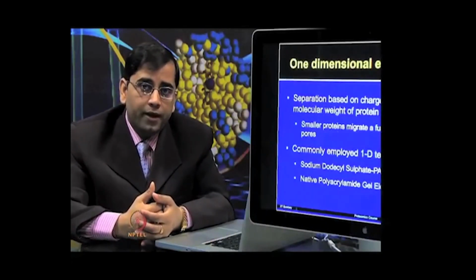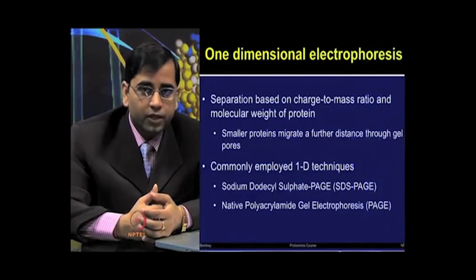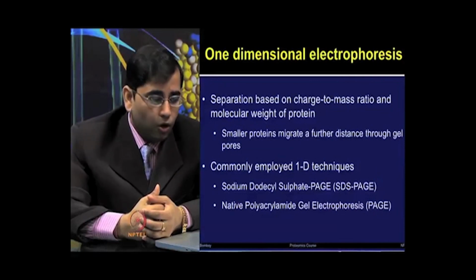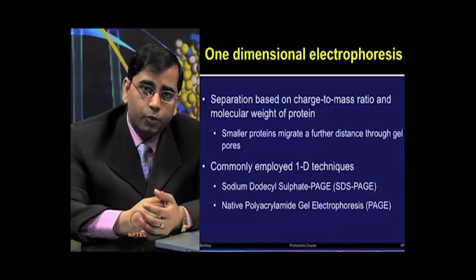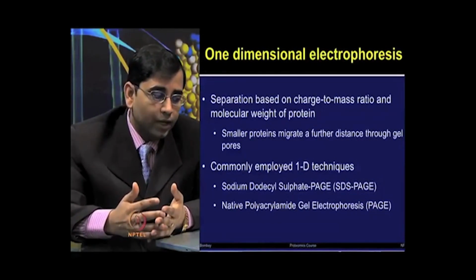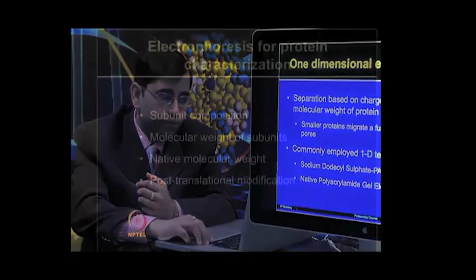Commonly employed one-dimensional techniques include sodium dodecyl sulfate PAGE, SDS-PAGE, or another technique which is used for studying the protein in the native form, known as native polyacrylamide gel electrophoresis or PAGE.